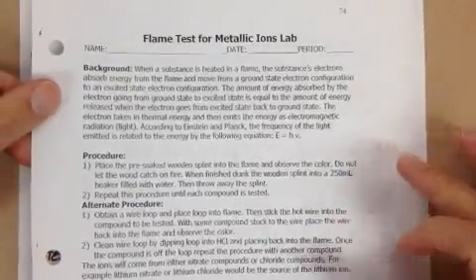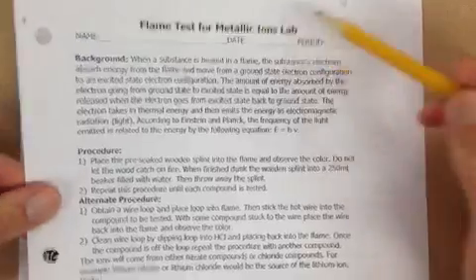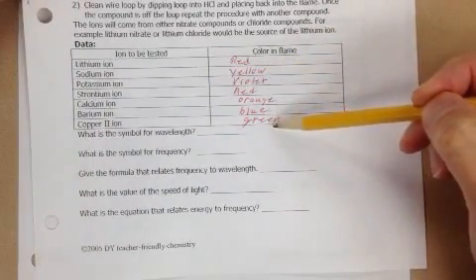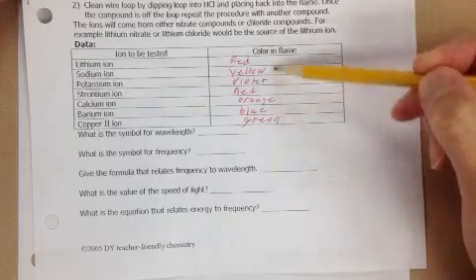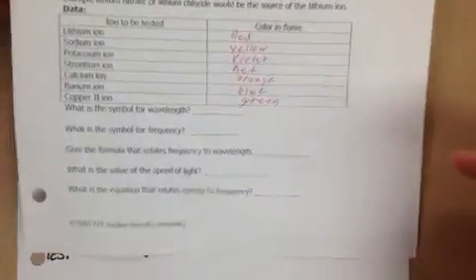Alright, this video is to show you how to do the flame test for the metallic ion lab. When we did the flame test in class, I want you to record those colors. That's what we found in class. I'll hit pause and write down those colors.